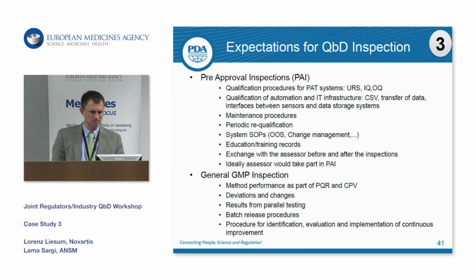A very special and important topic, from my experience of inspections, is the qualification of the automation and IT infrastructure, the computerized system validation, especially the transfer of the data from the probes to the system and the interfaces between the probes and the data storage systems has to be proved. This should definitely be a well-structured part of the qualification.